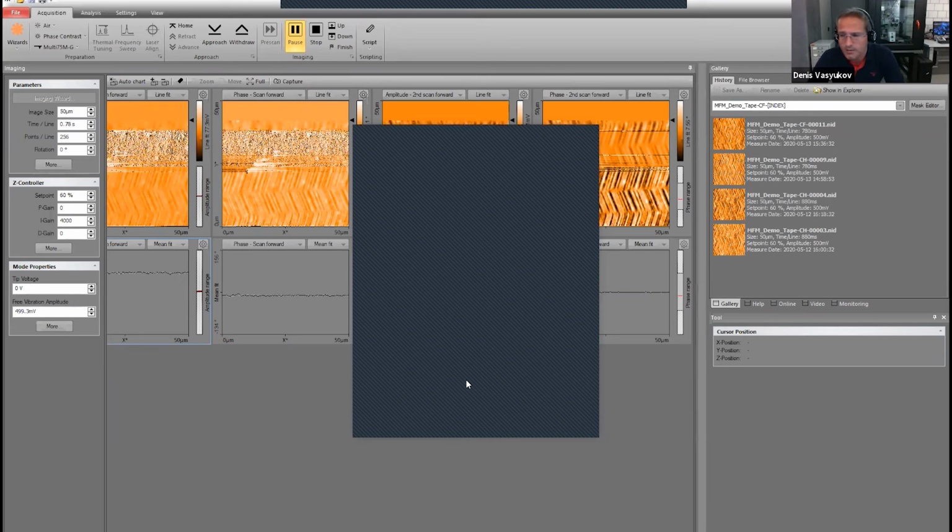But even then, what we see sometimes is that there is electrostatic interaction even in grounded samples, if you have different metals on top of each other. What we recommend, unfortunately I don't have it right on top of my head, is that there are ways to cancel this electrostatic interaction by doing a combined MFM and KPFM measurement.